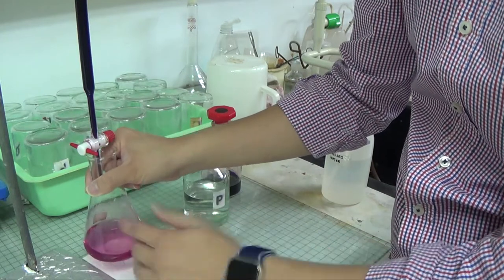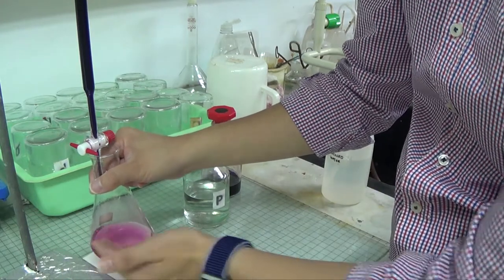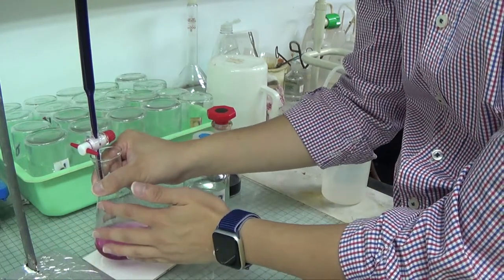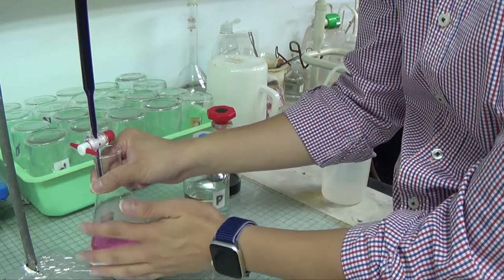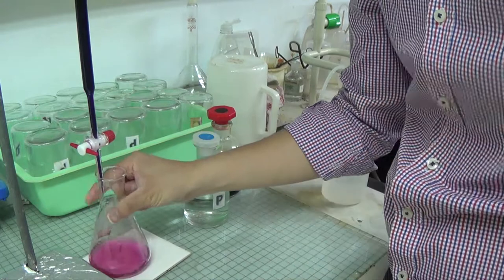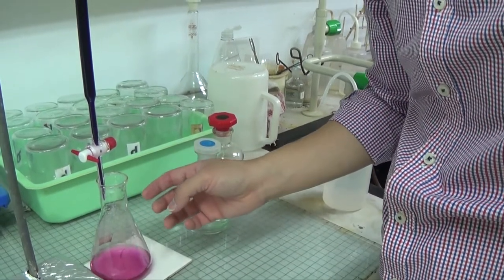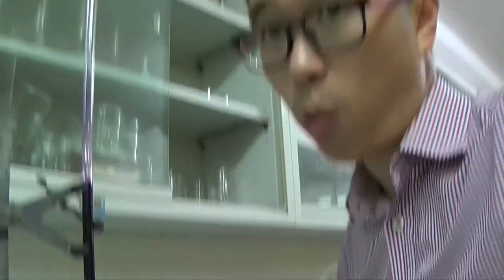That is because all the iron 2 has gone to iron 3, so I'm left with just KMnO4 that is left unreacted because there's no more Fe2+ to be oxidized by the acidified KMnO4, so it just remained purple. So this is excess, this is rough titration. You have to do a rough titration in order to know roughly when to stop.